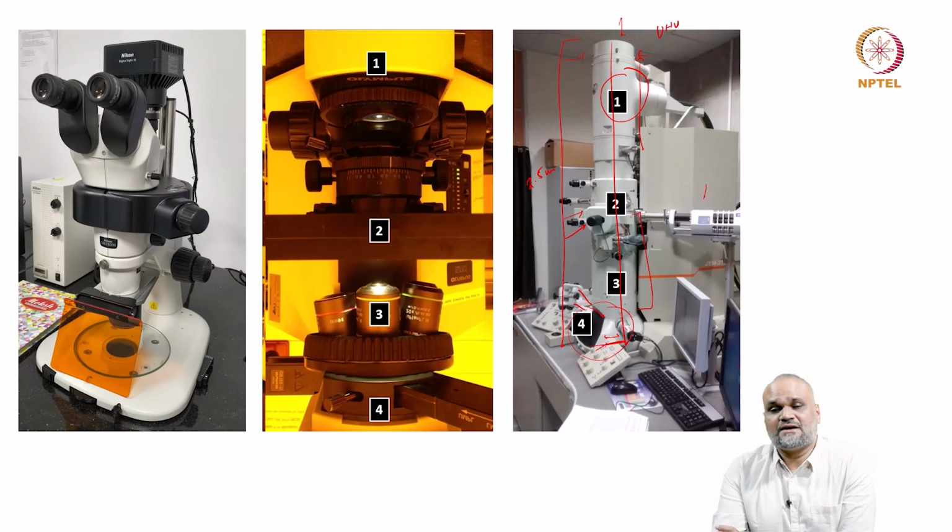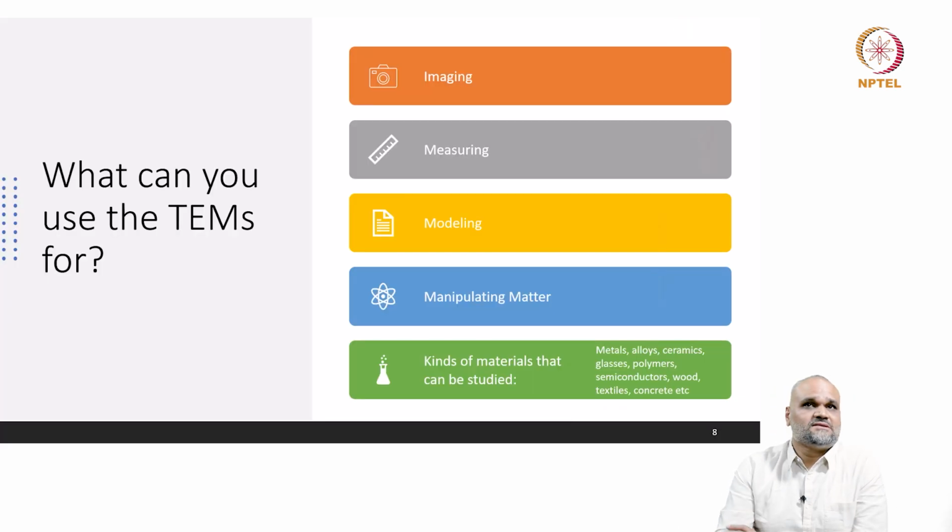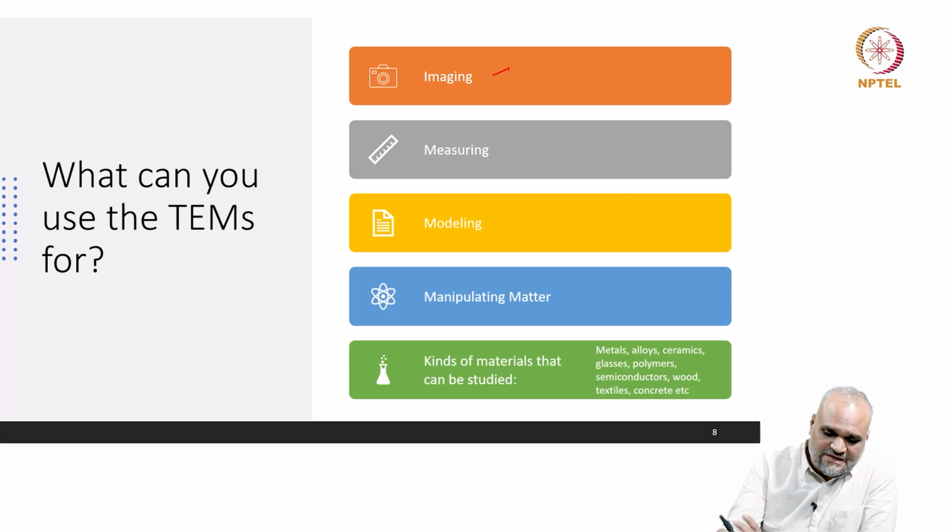So that is how an electron microscope looks. And if I move on, what do I use these electron microscopes for? What sort of information can I get using imaging systems as powerful and as large as these? If I move to my next slide, you can see that electron microscopes can be used for imaging. I can get information from features as small as 0.3 angstroms with modern-day corrected microscopes.